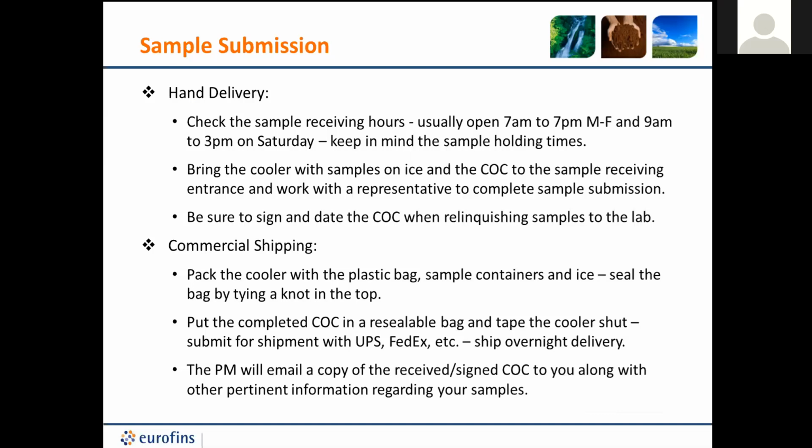Now, there's another follow-up question to that last one. How about dry ice? You do not want to use dry ice. Normally, if you've got water in a glass container, it's going to freeze and break the container. And if you're shipping by FedEx, they have specific shipping regulations that you're going to want to make sure you're familiar with. So dry ice can be a little tricky.